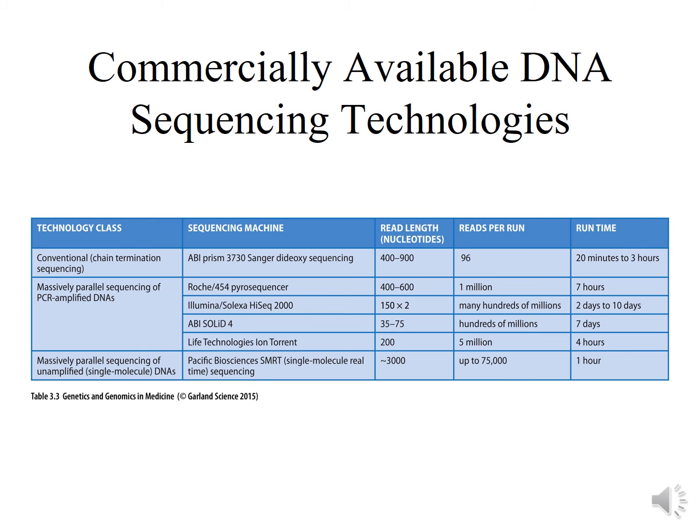Standard DNA dideoxy sequencing is a highly targeted method requiring the purification of specific sequences of interest that are then selected to be sequenced one after another. By contrast, massively parallel DNA sequencing is indiscriminate. All of the DNA fragments in a complex starting DNA sample can be simultaneously sequenced without any need for gel electrophoresis. The difference in sequencing output is therefore vast. Table 3.3 lists various next-generation sequencing technologies that are commercially well established.